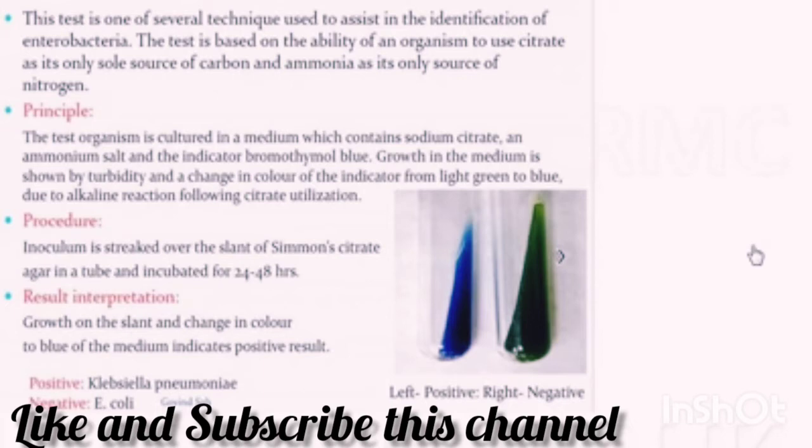Principle. The test organism is cultured in a medium which contains sodium citrate, an ammonium salt and the indicator bromothymol blue. Growth in the medium is shown by turbidity and a change in color of the indicator from light green to blue due to alkaline reaction following citrate utilization. It is positive in case of Klebsiella pneumoniae and negative in case of E. coli.